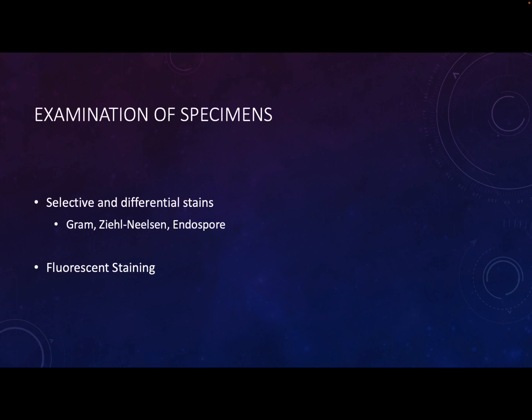We also have, especially for bacterial visualization, some selective and differential types of stains. The Gram stain is the classic one. Those of you who took bacteriology here know that doing a Gram stain was part of your midterm; you had to do it, and we graded it, right?